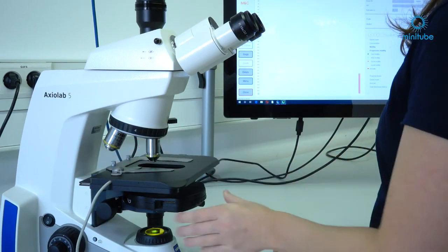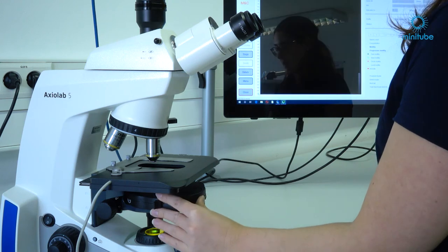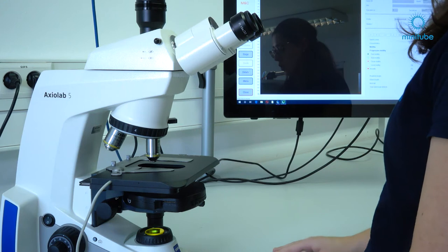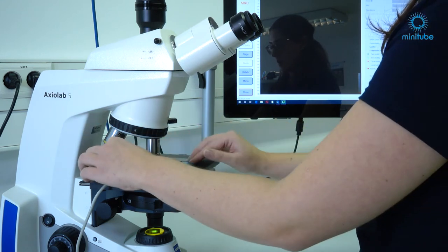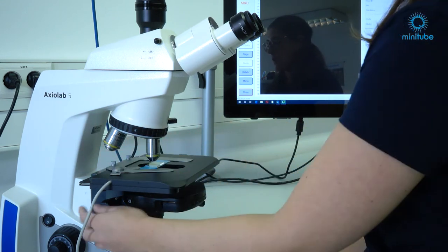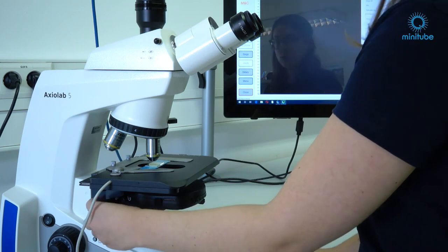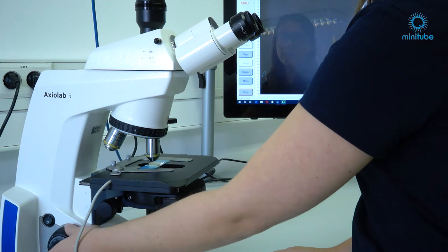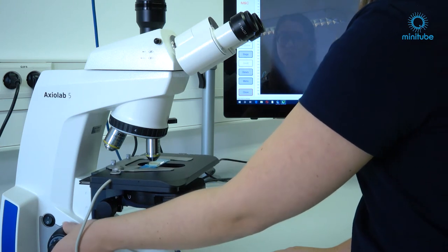At first swivel in the correct objective and make sure that the label of the objective fits to the condenser disc. Next check the light intensity and put a sample onto the stage. Then turn the knurled knob of the condenser to the top stop. Now focus on the sample by using the focus drive.